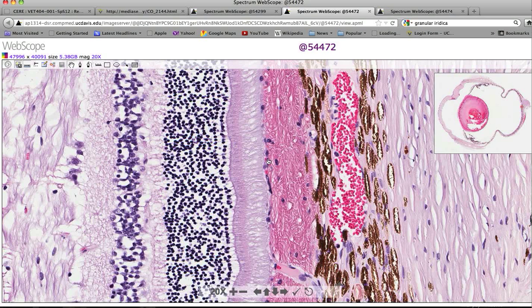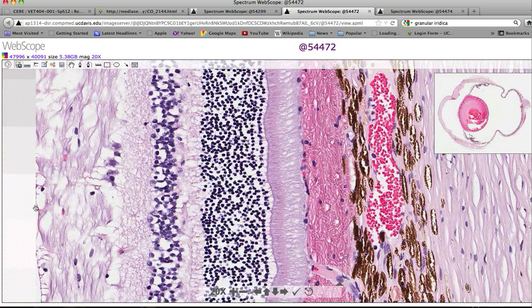So RPE, one more time, then photoreceptor outer segments, which are the rods and cones. Here it's more of a suggested line — it doesn't pop out necessarily in many standard preparations — but this is the outer limiting membrane. You don't need to know these details, but it's basically tight junctions of Mueller cells that hold the retina together. They also make up the inner limiting membrane. Imagine cells that span the width and make these thin membranes through their tight junctions to hold everything together.